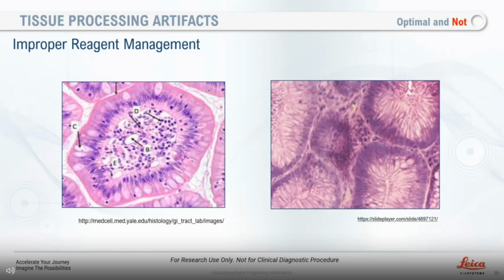Next question. What do you exactly mean by chatter? Oh, sure. Chatter is when the tissue is, of course, having difficulty on the microtome, and it's dry for one reason or another. And another term we use is Venetian blinds, if that helps.